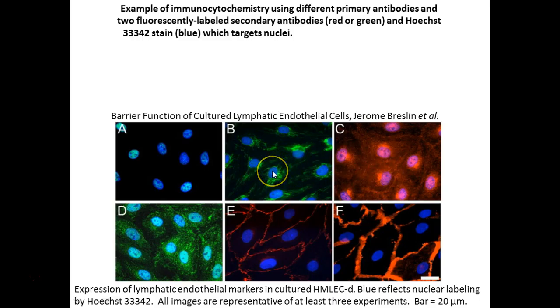And they're kind of near the nucleus, huh? Where these guys are all spread out, this particular protein they were looking at. And this other one is all spread out throughout the cell. And then this other protein, look, it was only around the edges of the cells, right? So probably associated with the membrane, huh? So really pretty to look at, right?